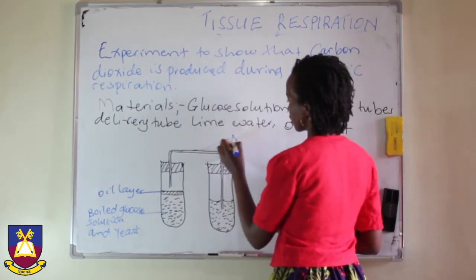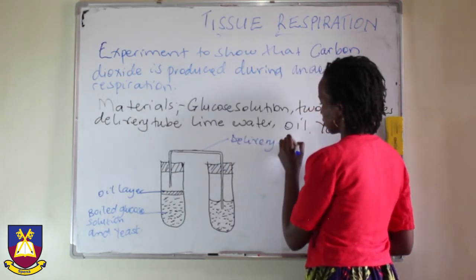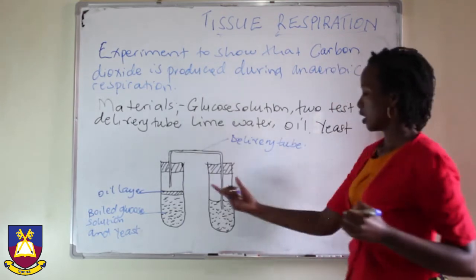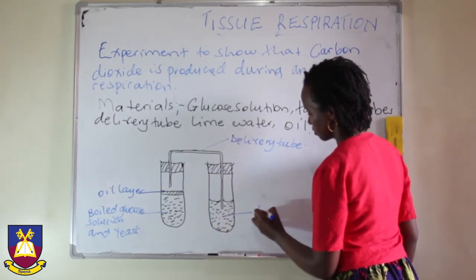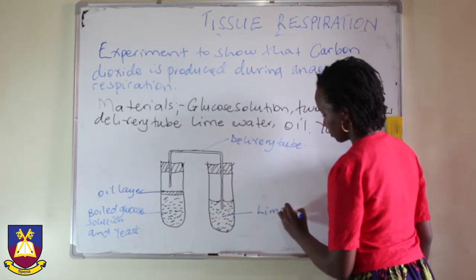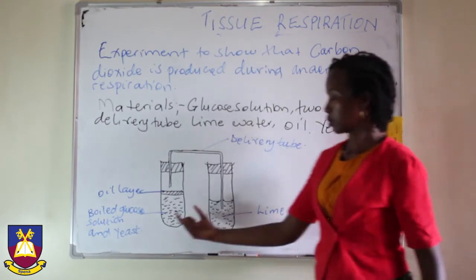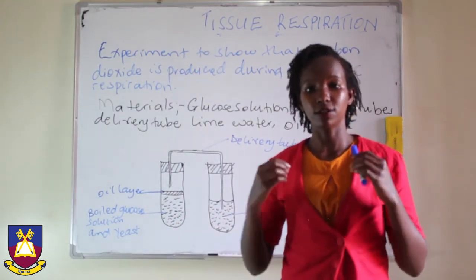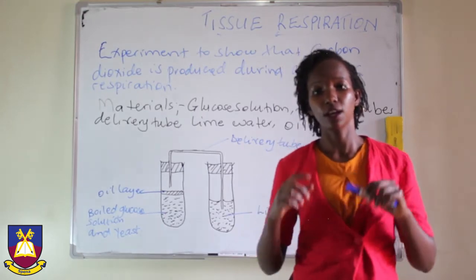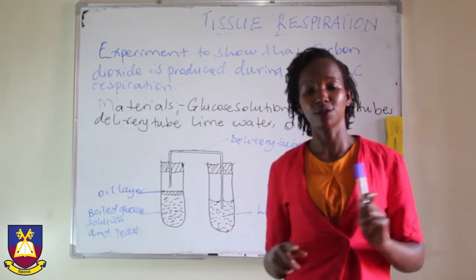This is a delivery tube, all the way to this other test tube that contains lime water. Now, lime water is the reagent that's used to confirm the presence of carbon dioxide in science, and it's a known truth.